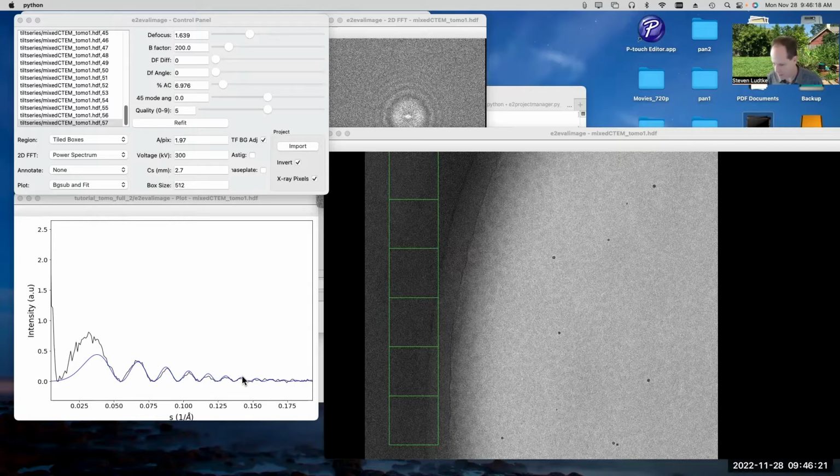In the EMAN approach, it flips the problem on its head. So first you do the 3D reconstruction of the tomogram. It determines the geometry of all the tilts in the tilt series. The approximate geometry, meaning that it doesn't necessarily have the z depth. It doesn't really have any information about the z depth yet, but it knows the tilt, and it knows the direction of the tilt already for each tilt image.